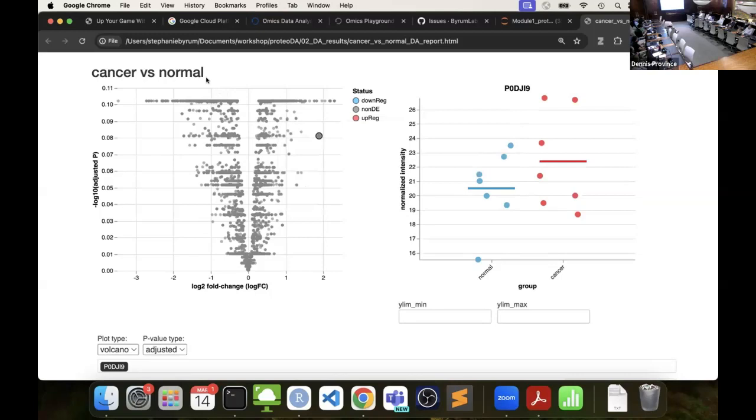So the labeling is going to give you an indication of the order of the fold change and how we interpret it. I do this on purpose so that I remember how we ran things. So anything that's on a positive upregulation is what is going to be up in that first group listed in the label. If you forget, you can click on it and then you can see these are our 2 groups in this data set. And overall, that one is slightly increased compared to the normal group.